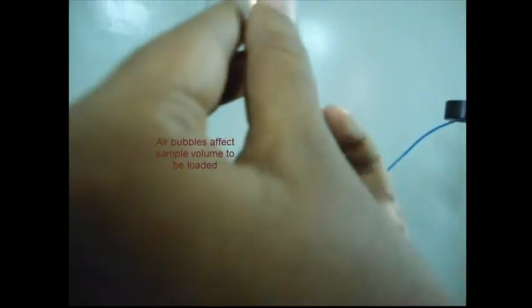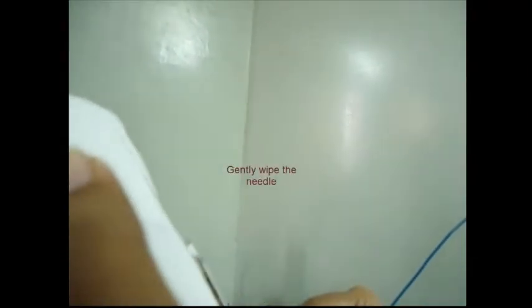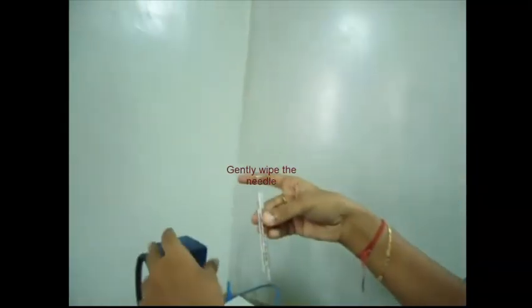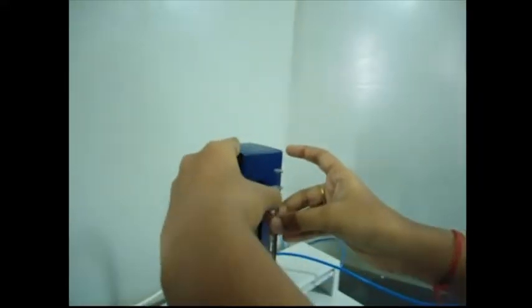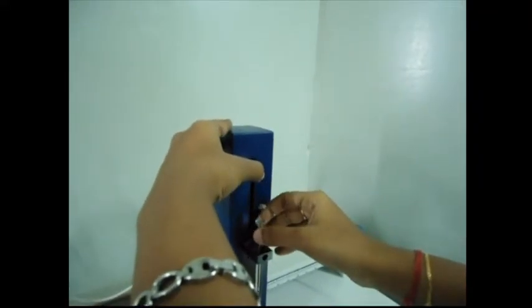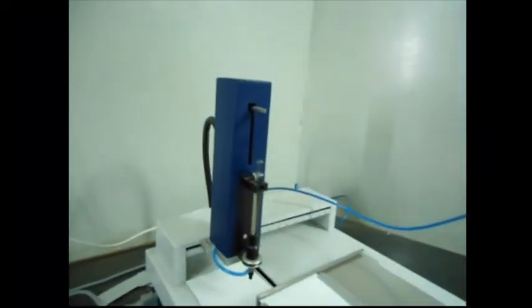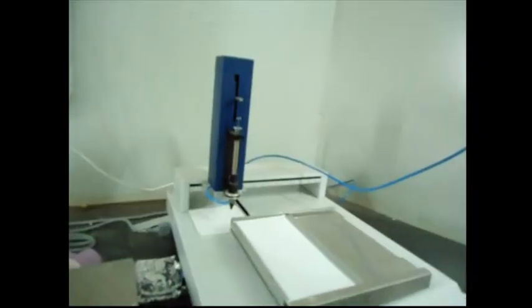Carefully check the syringe to remove air bubbles because it may affect the sample amount. Again, fit the syringe and allow it to work automatically.